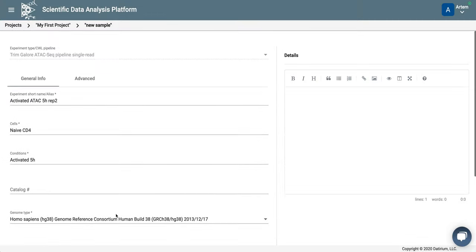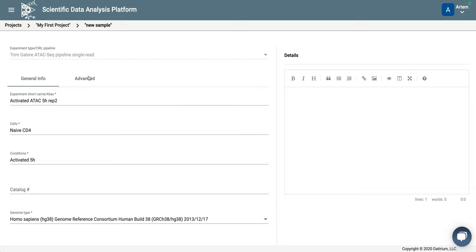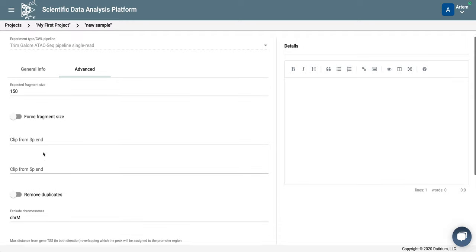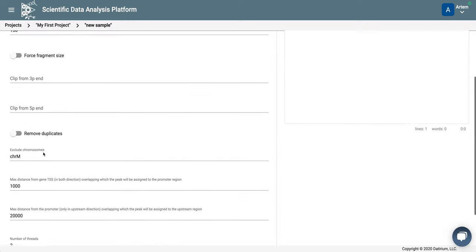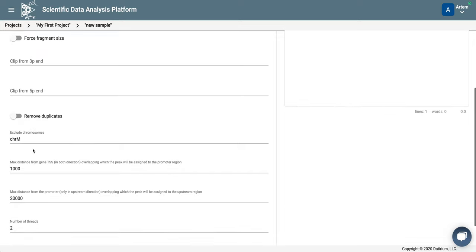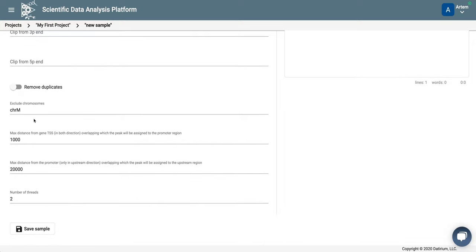Let's look at the advanced parameters of the pipeline. So expected fragment size. We don't need to clip from either end. We don't want, I usually prefer not to remove duplicates.